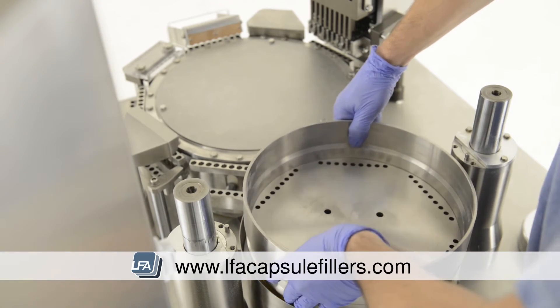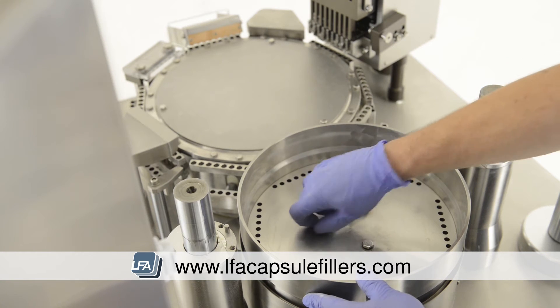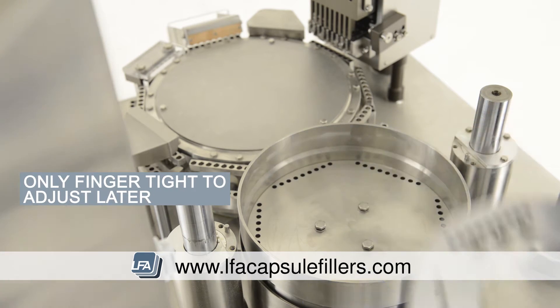Now we start building the tamping turret back up. Start with the bottom section of the tamping turret and reinsert the three bolts and tighten, but leave some play so we can still adjust it.